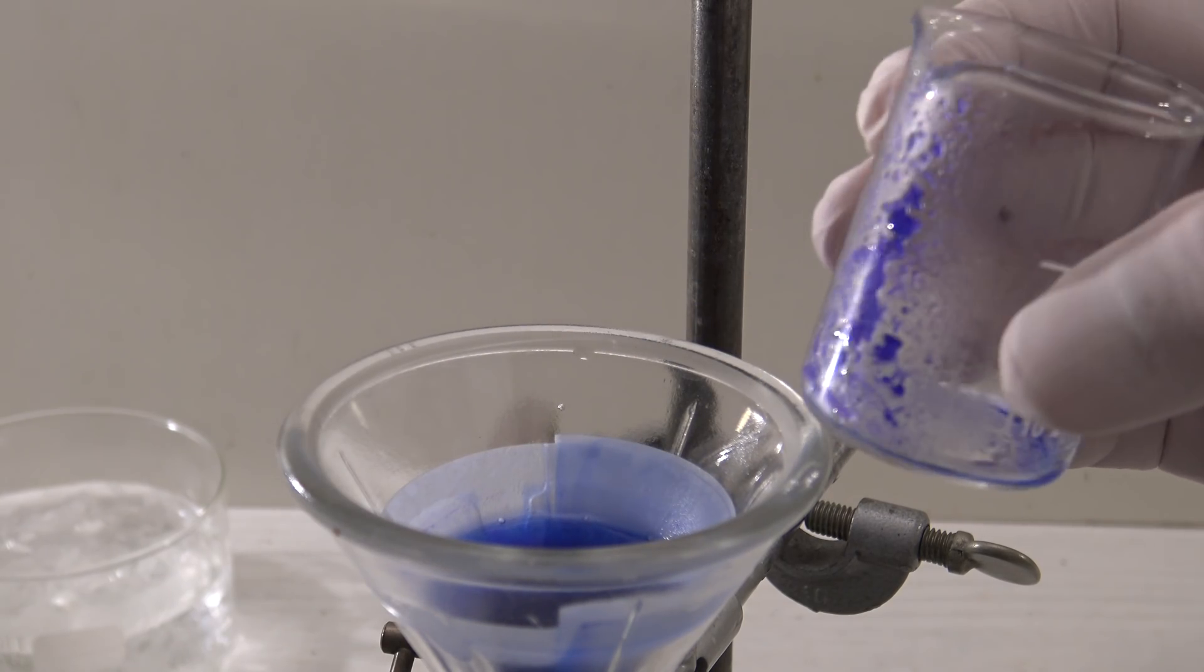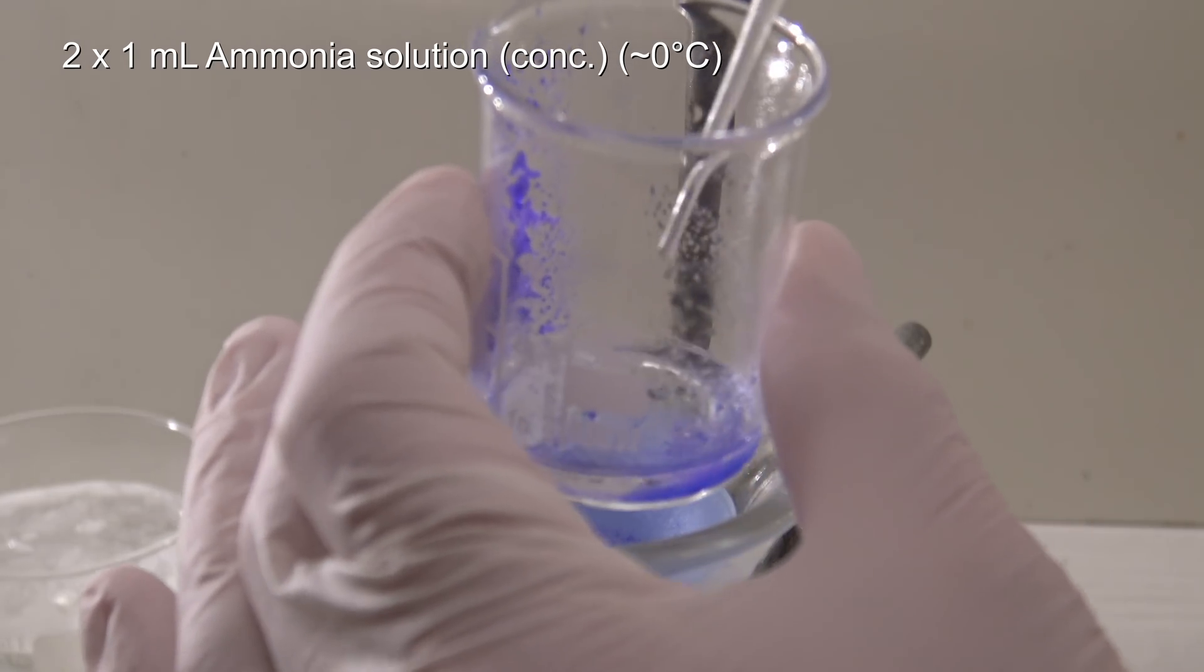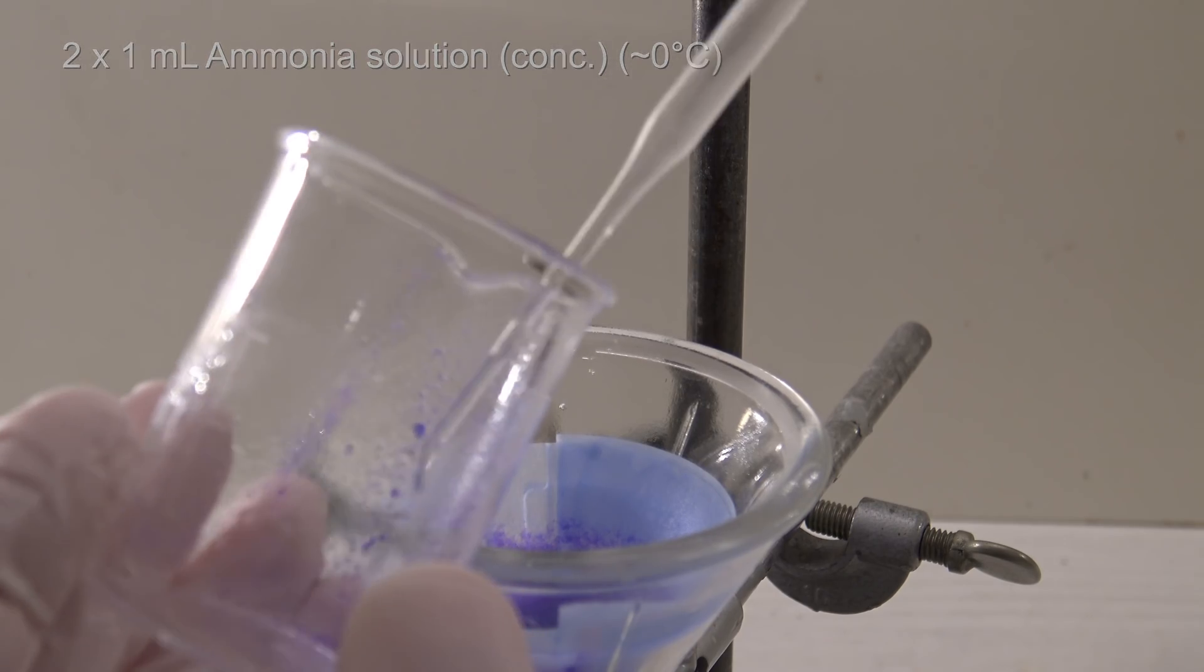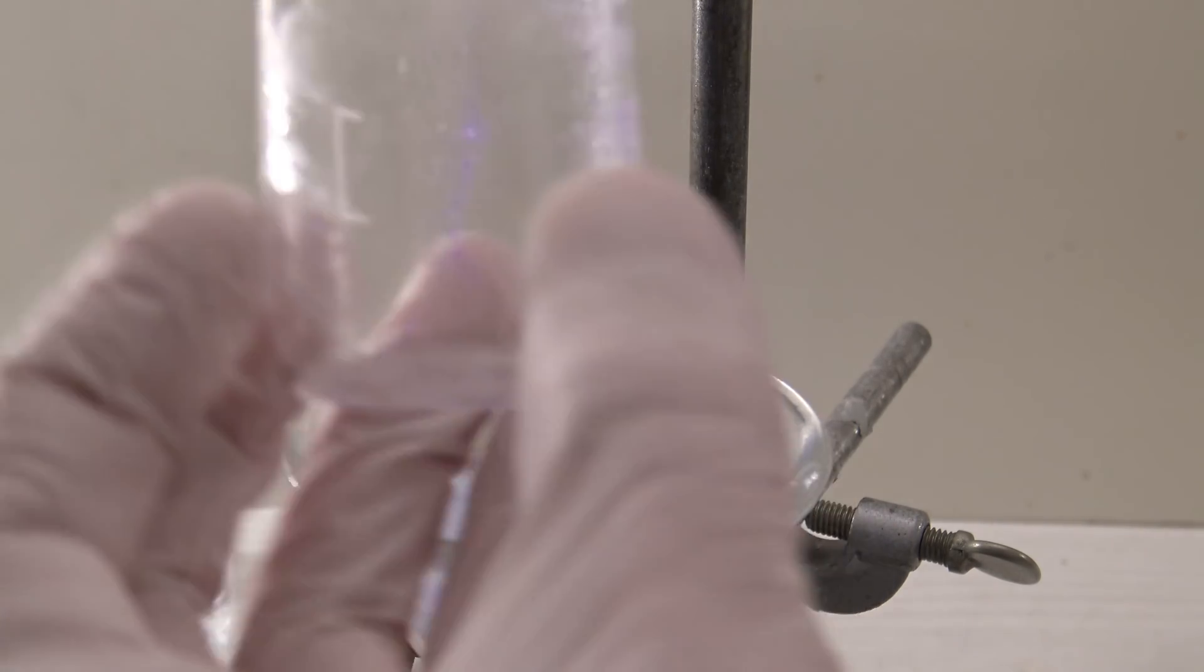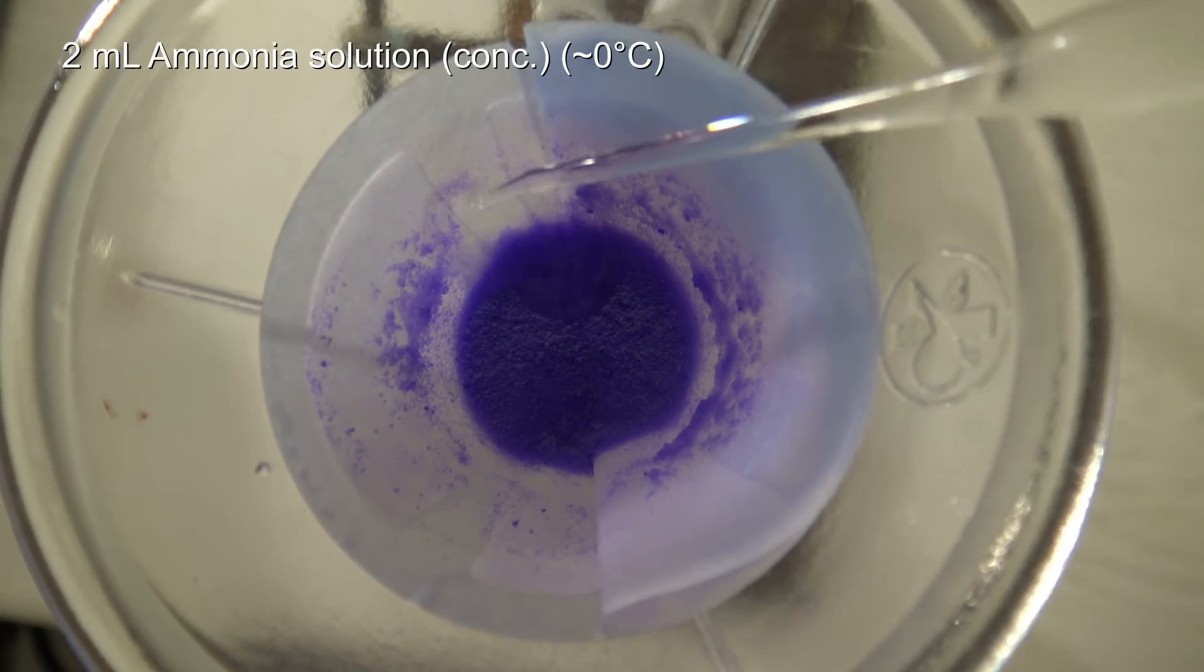The residue in the beaker was washed out two times with one milliliter of concentrated ice-cold ammonia solution. Then, the precipitate was washed again with two milliliters of ice-cold ammonia.